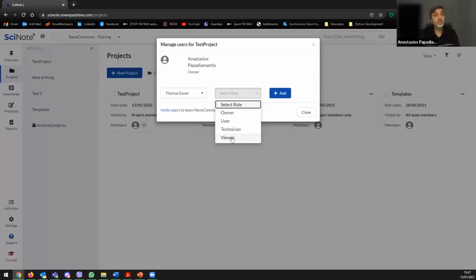Usually you do this when you have people, and I would recommend having all the PIs as viewers and not doing the work, so that they can't mess things up.